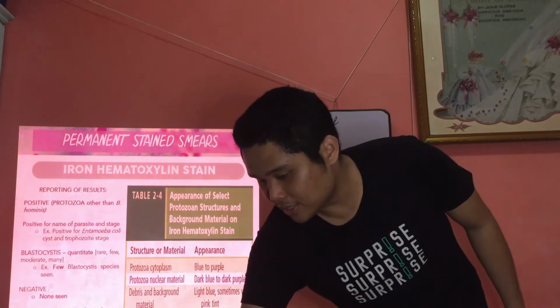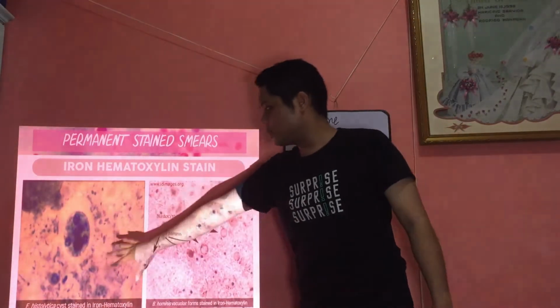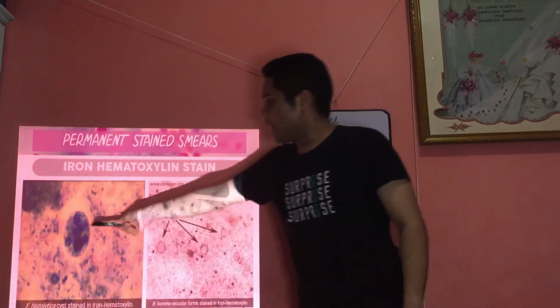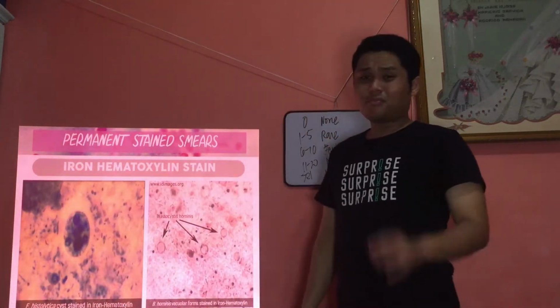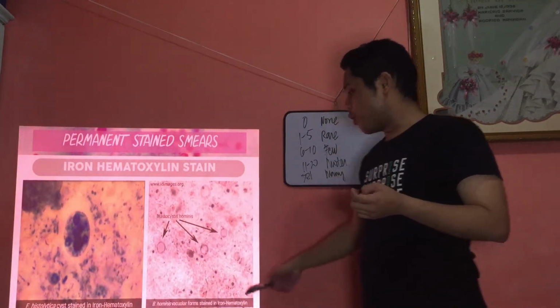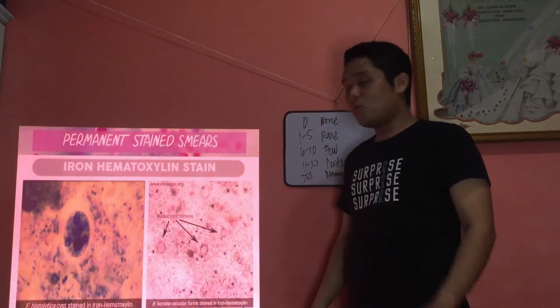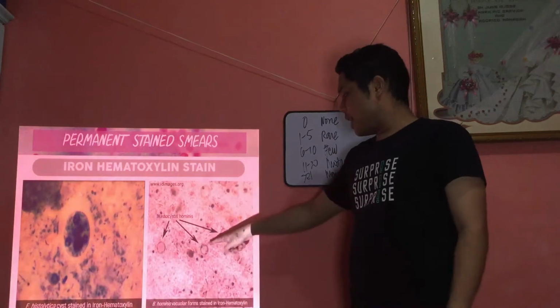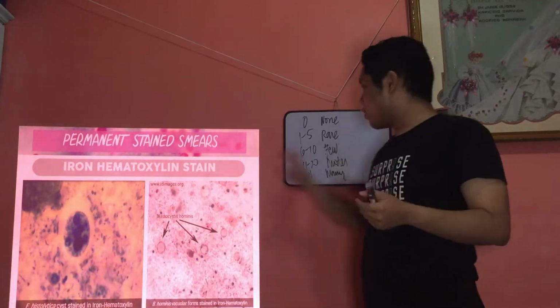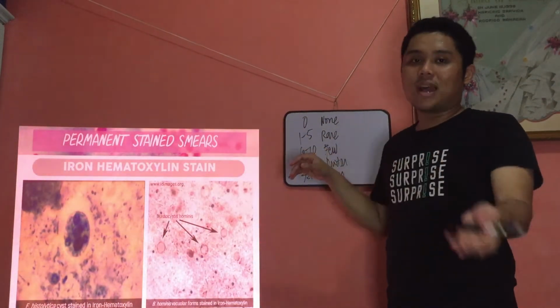So here are some of the pictures. Ayan. So as you can see, blue background with a pink tint. And then you have here Entamoeba histolytica. As you can see, the nuclei are color blue, di ba? Or purple ba to? Blue. Okay, and we have here Blastocystis hominis, vacuolar forms. As you can see, the background is still bluish with a pink tint. And then you have here the Blastocystis hominis. So we then quantitate that, based again on the given quantitation scale or grading of your laboratory.